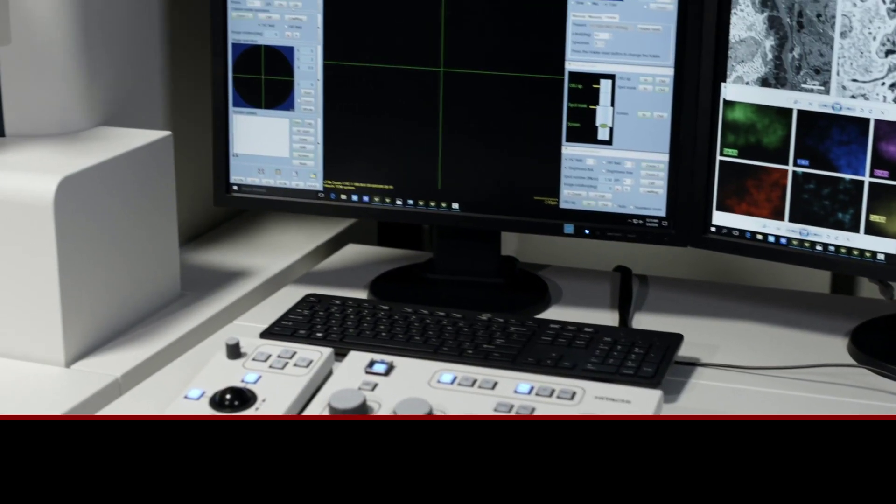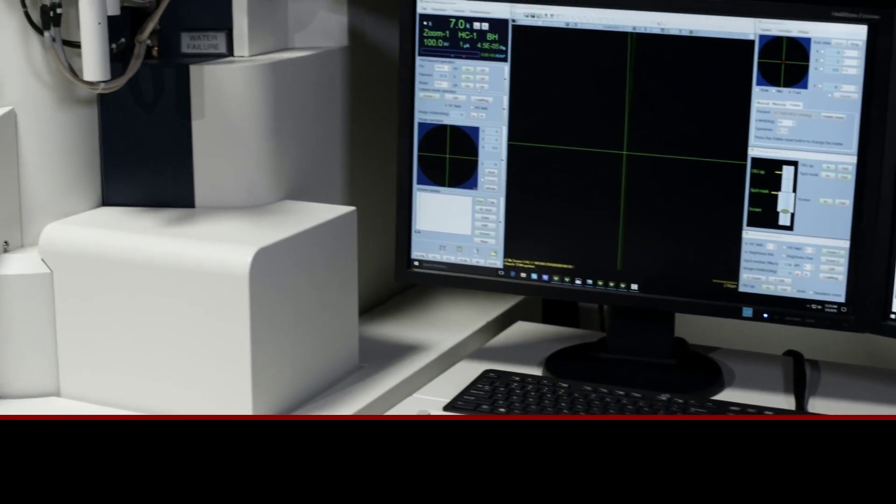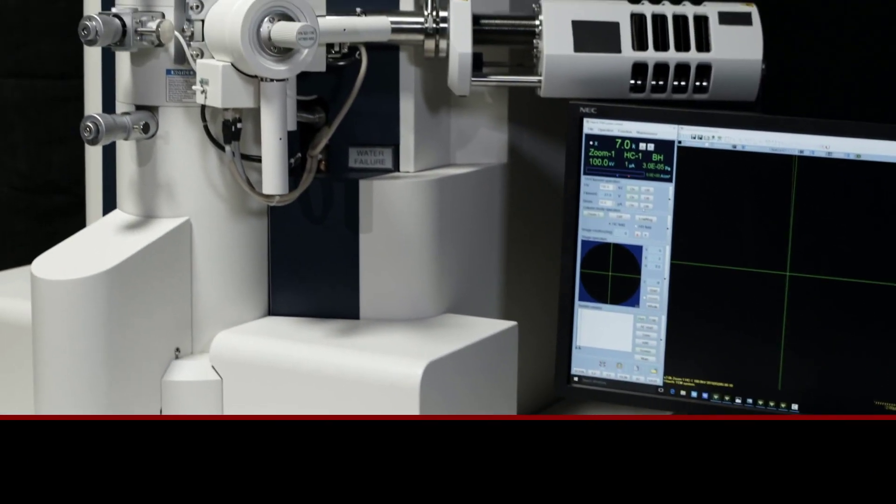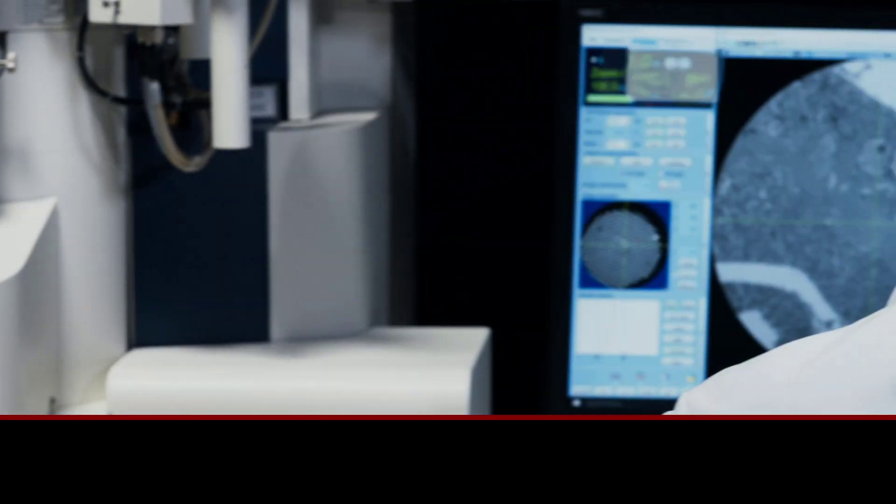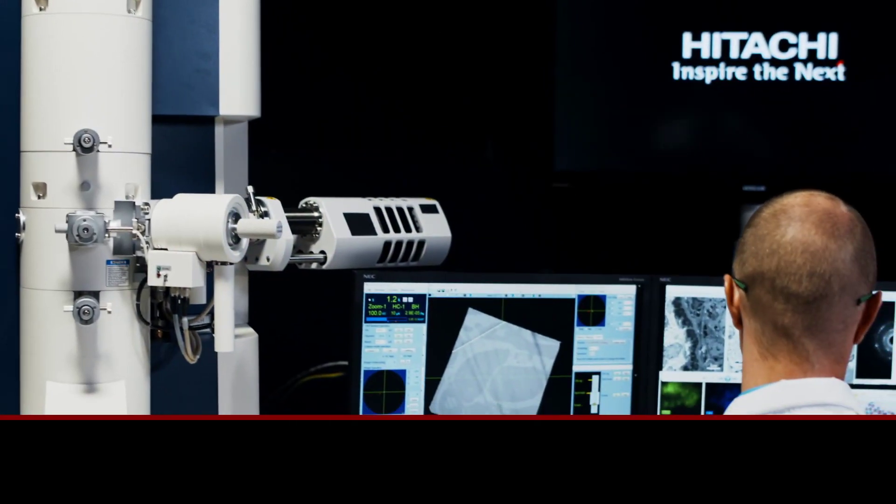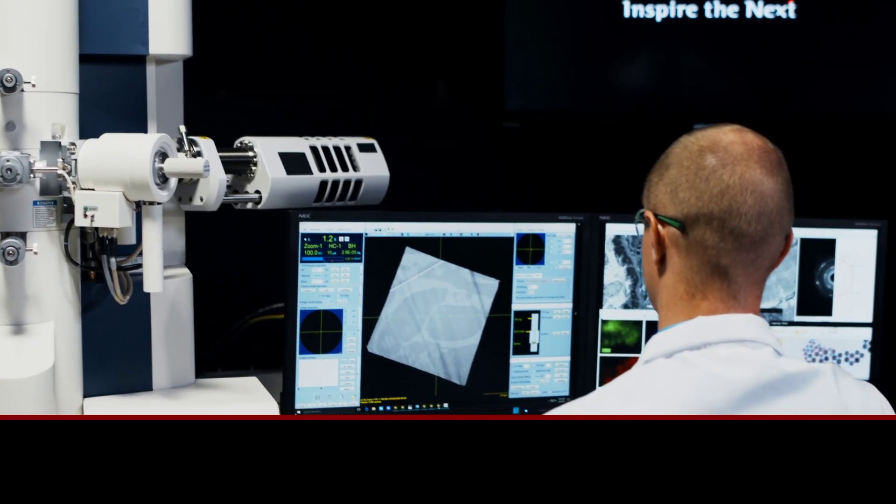The revolutionary HT7800 series redefines what is possible with a 120kV TEM and combines advanced technology with an intuitive user interface to provide a reliable, versatile, and powerful workhorse instrument that everyone can use.